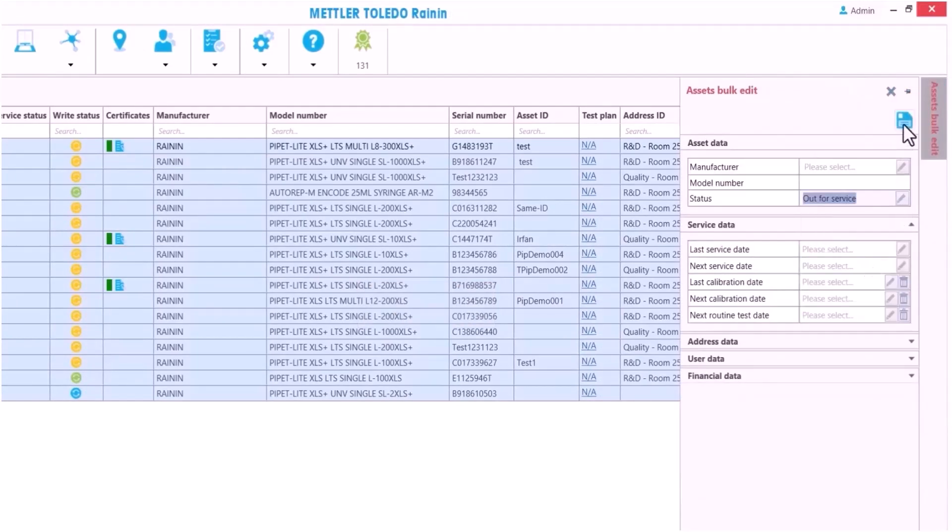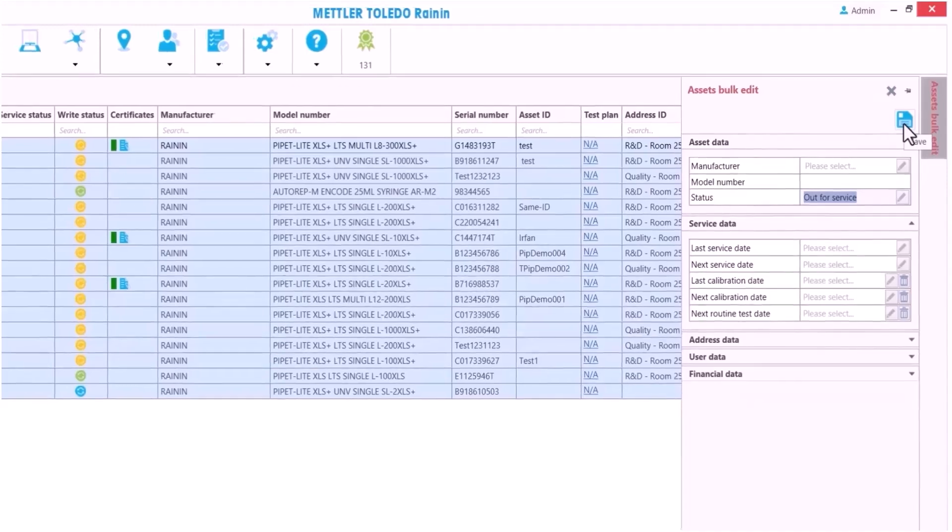Pipette X will send reminder emails to these users to send in the pipettes. I can also use this as a pickup list.